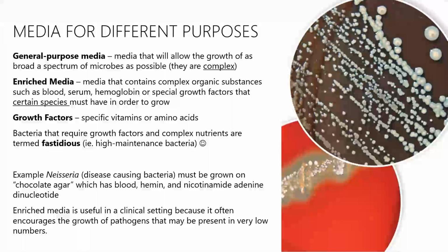Like if I leave the lid off in the lab for an hour, put it in the incubator, come back the next day, a whole slew of different looking colonies are going to be growing. Pretty much anything and everything. Enriched media is media that contains complex organic substances. So again, that would be like our last slide where maybe we're adding blood or special growth factors to it, all with the goal of getting some species to grow and not others.